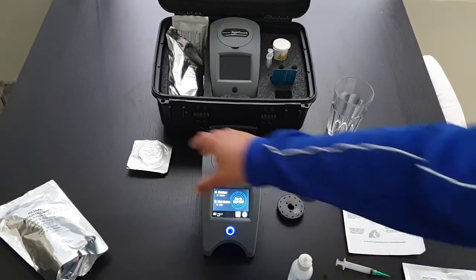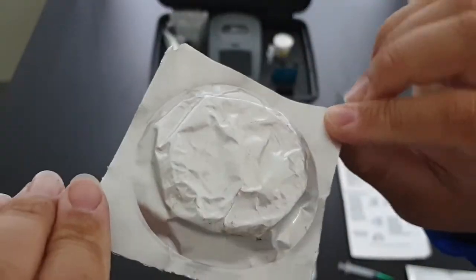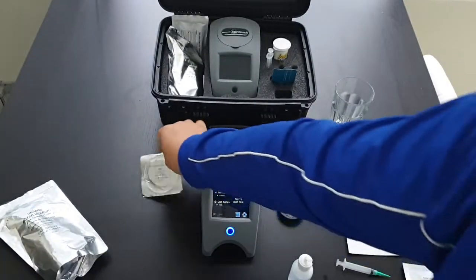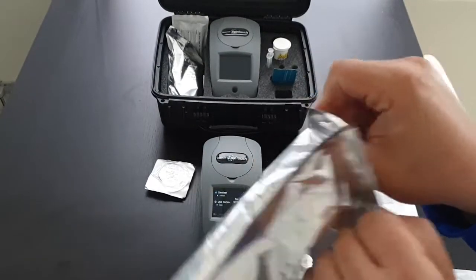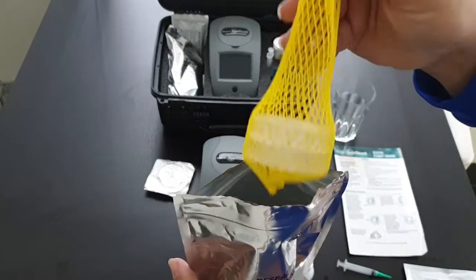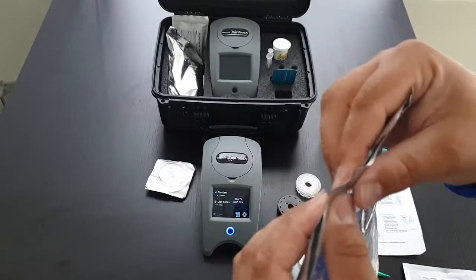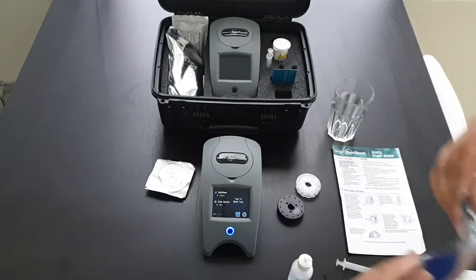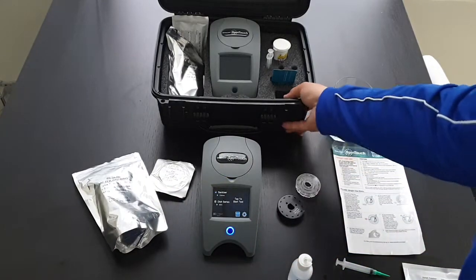These are the old discs that used to come in individual packets. The new discs come in a pack of 10. This needs to remain sealed or it will ruin the discs. These need to be kept cool — if you leave them in a hot car it will affect the results and you can get false readings. The common thing is to get a high combined chlorine.